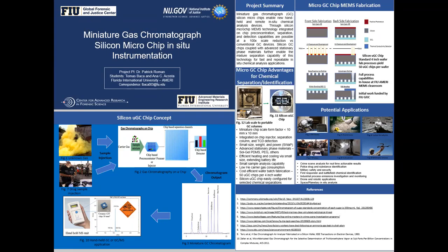Are you anticipating that this device would be used in the field exclusively or as a benchtop replacement in a lab? Well, in a lab, the lab units will probably stay. I don't see a reason to get rid of them. In some cases, maybe the lab units will be better. But after all, the point of the handheld is to be able to do analysis in the field. So if for whatever reason you just need the information about the chemicals you're analyzing as soon as possible, that is what the handheld device solves.